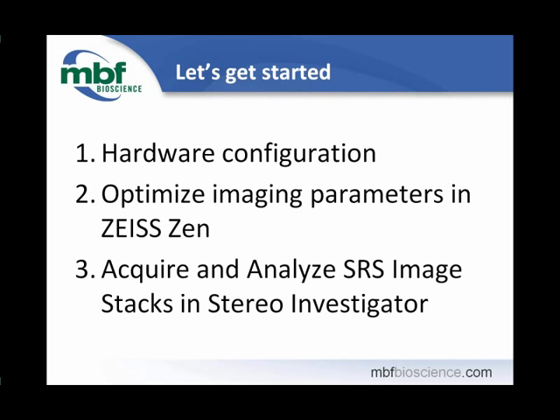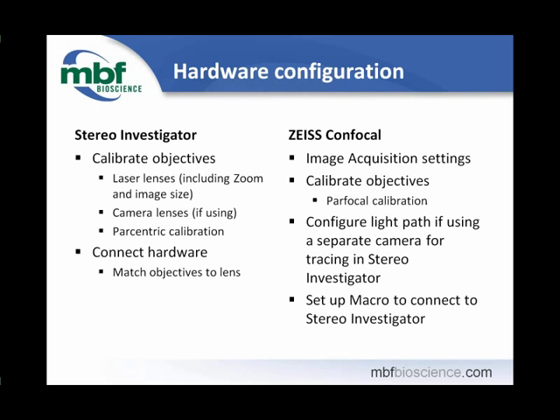So Sue, before we continue, why don't you tell us a little bit about the hardware configurations that are required for doing this kind of stereology? Sure. If you are a current Stereo Investigator customer right now, you're very familiar with what's required in order to use your software efficiently. One of the hallmarks of it is calibrating your objectives to match the scaling for your acquisition device. In this case, it's usually a camera.